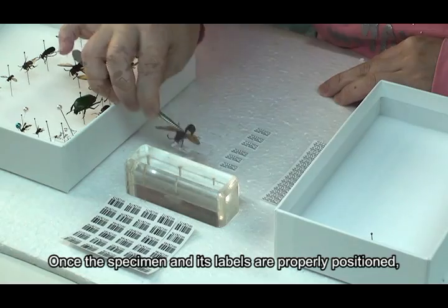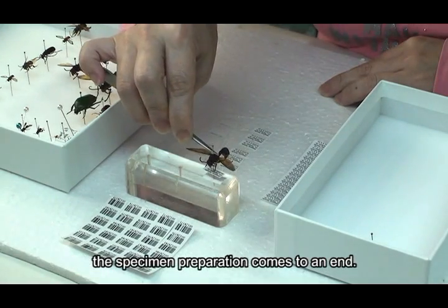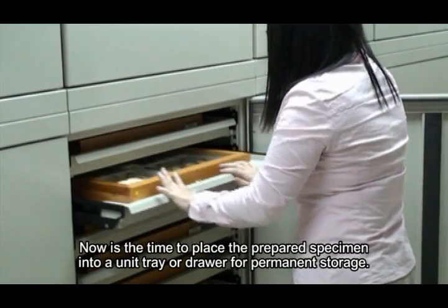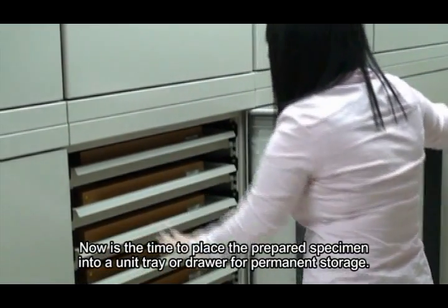Once the specimen and its labels are properly positioned, the specimen preparation comes to an end. Now is the time to place the prepared specimen into a unit tray or drawer for permanent storage.